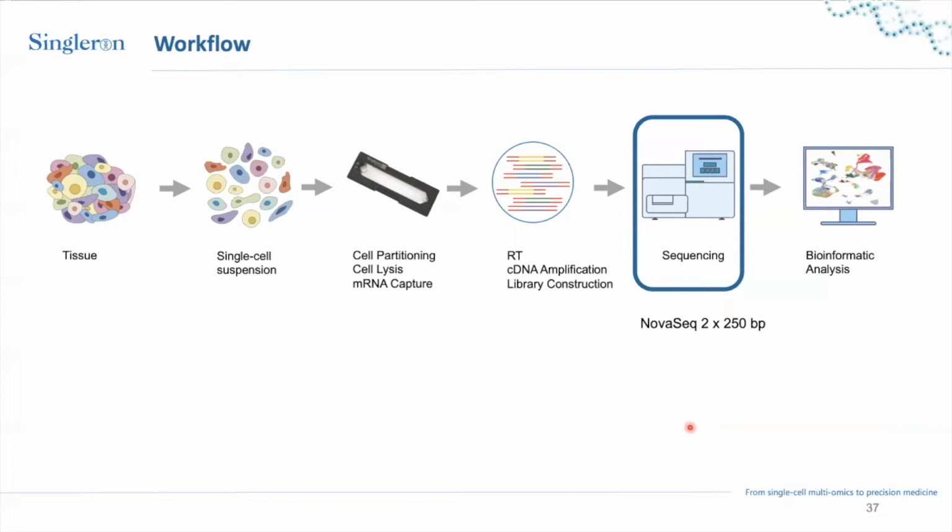I didn't mention them because at the moment the technology is not quite there yet. The error rate for sequencing is very high. And if you're dealing with individual cells, thousands of cells at the same time, this error rate multiplies, and you don't want to have this. It's basically highly erroneous. That's why we are still limited to short read sequencing.